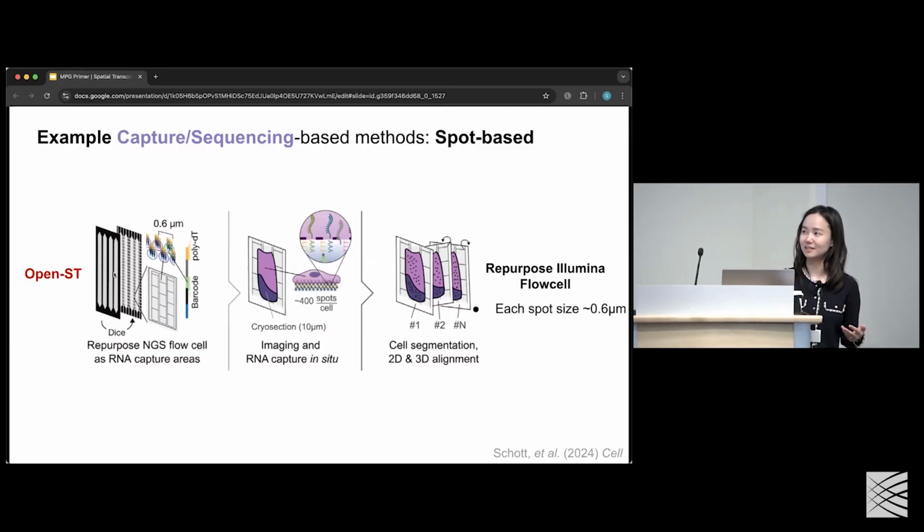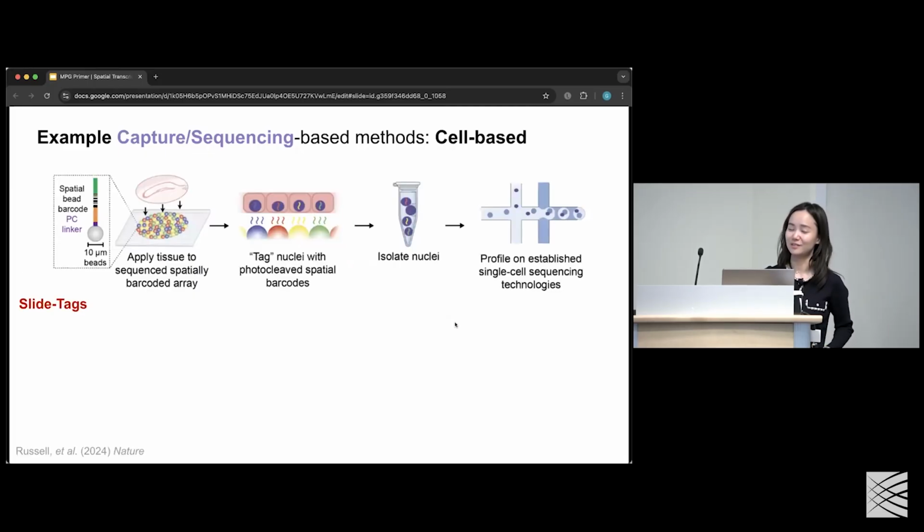So you can see in length it's actually quite good, I forget exactly how many centimeters, maybe 9 or 10 centimeters or something like that. But in width, it's small. But I think this is a really exciting idea. And again, you have the RNAs bind to that flow cell, and you're then able to get very high resolution information.